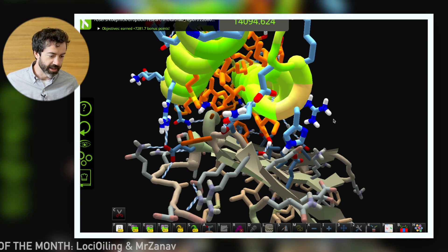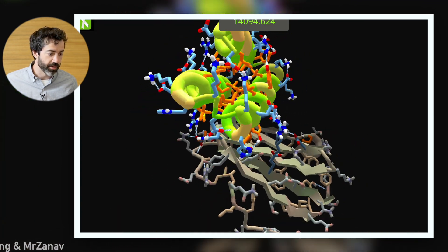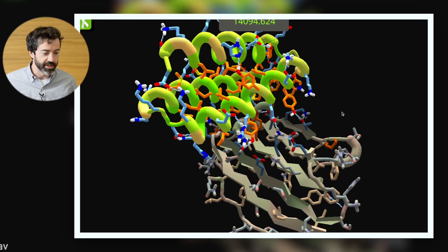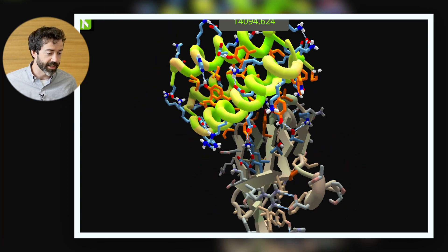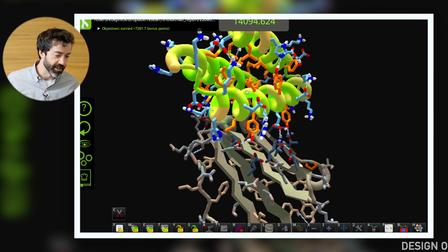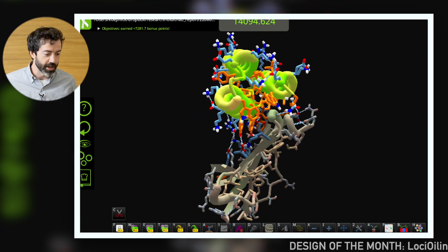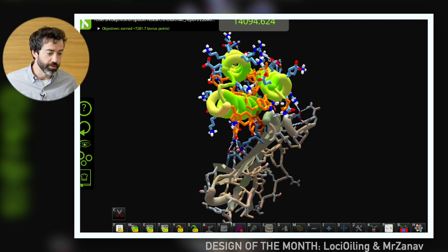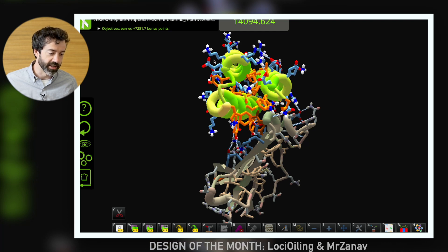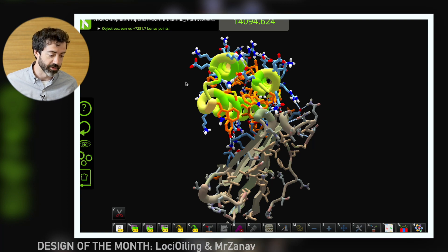So this looks like an excellent three helix bundle design. Three helix bundles tend to be very stable because they have lots of secondary structure, these helices, in very short stable loops connecting the helices. We see that there are lots of orange hydrophobics in the interior and lots of blue hydrophilic side chains on the outside of this design. And that should help this protein fold up and remain soluble.